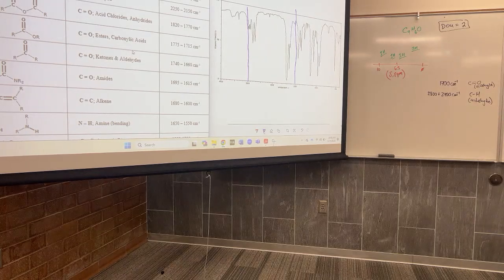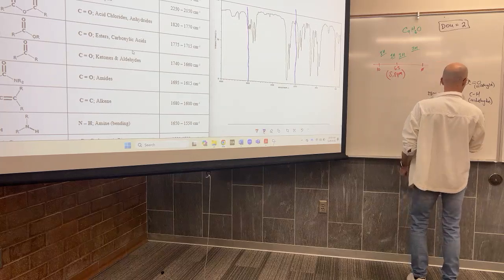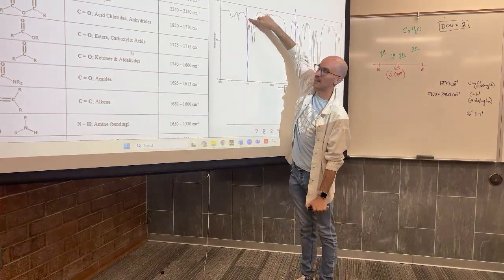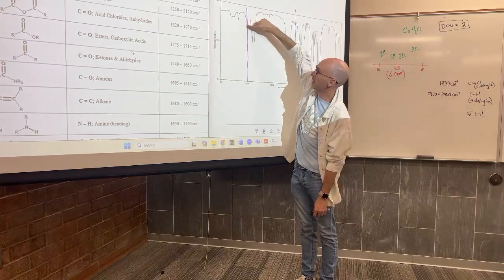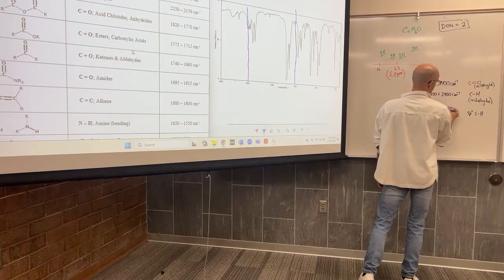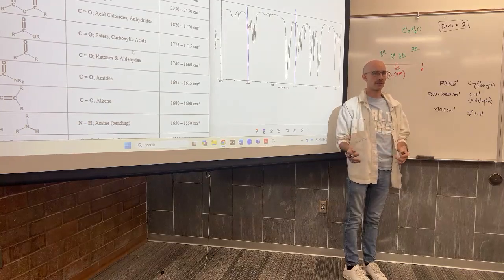What else do you guys see? I see an sp2 carbon hydrogen bond. sp2 CH. Where do you see that absorbing? I think the line is a little bit wrong, but it's between 3150 and 3000. I agree. This line, a little messy, right? I couldn't give you a straight line, but I will on tests and on the exam. And I think there is a peak here to the left. And so we've got this absorption around 3000. Maybe it's a little bit above it, so I can say around 3010 wave numbers. I'm really just approximating. But if you said there's a peak between 3150 and 3000.